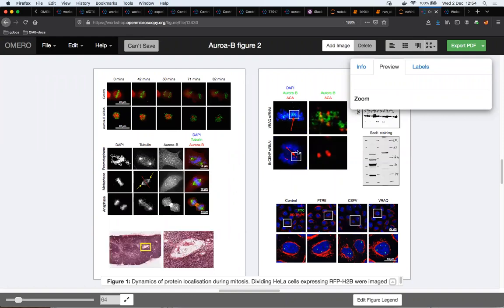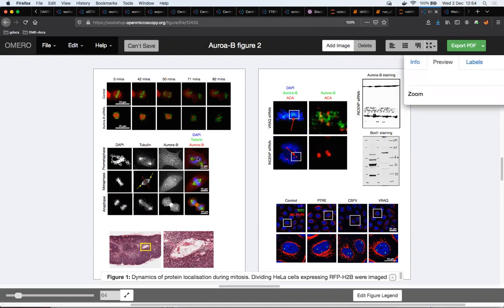And this more or less showcases everything that can be done with OMERO.figure. I can create a multi-page figure. I can add a legend here at the bottom. I can draw new regions of interest, such as these arrows here, which were drawn post hoc in the figure. This would be on top of those regions of interest which I showed you how to get from OMERO, which were ultimately coming from the image analysis. So I can draw such arrows.